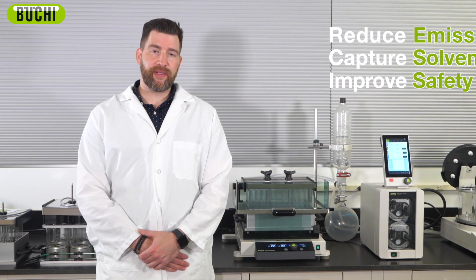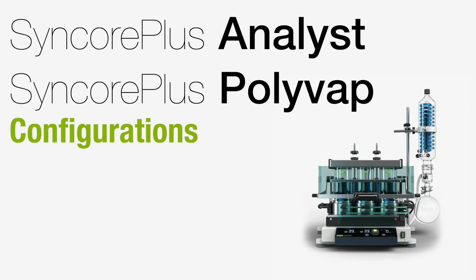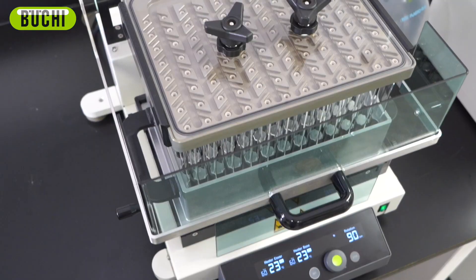When it comes to sampling, synthesis, extraction, or purification, our Syncor Plus Parallel Evaporator comes in two configurations: the Syncor Plus Analyst or the Syncor Plus Polyvap.